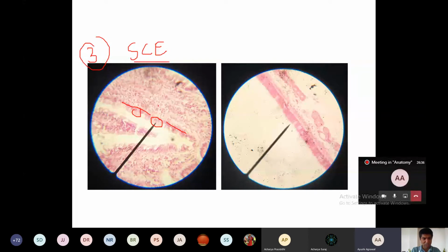Okay, no problem. I see. Now you learn it. This is quite different pictures we are giving to you than showed before in the section. So you may be confused, but now onward you do not confuse. What is this one? Third one, simple columnar epithelium.